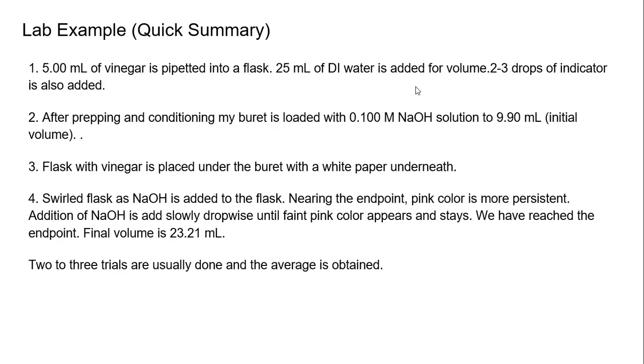I will swirl the flask in one hand as I add sodium hydroxide. As I near the end point, the pink color will stay longer, which means I'm going to slow down and slowly close the stopcock to only a very small drop at a time. And I'll eventually get to an endpoint, and my final volume is 23.21 mL. You normally do 2 to 3 trials, and you take the average, and the average is what you go forward with.